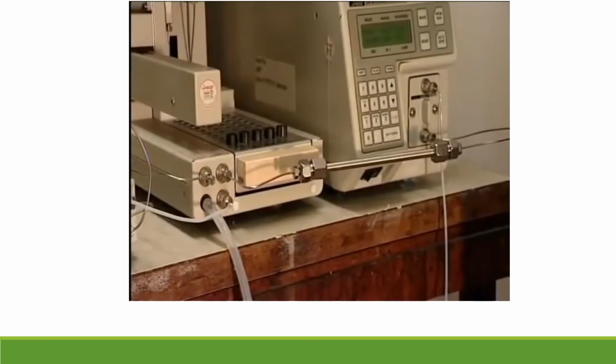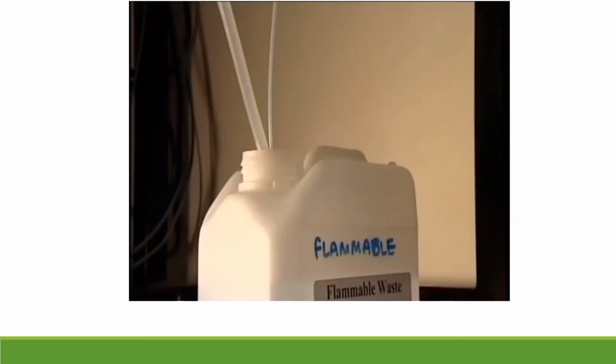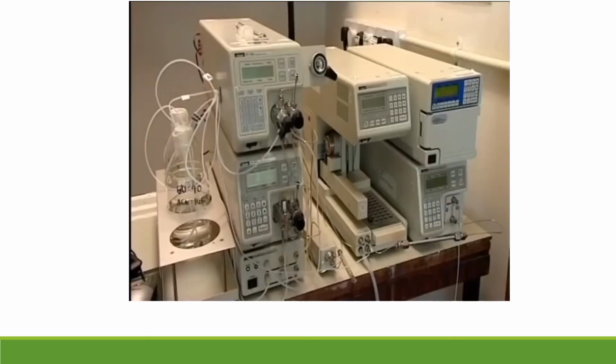In paper chromatography, the solvent moves along the paper by capillary action. In HPLC, the liquid is forced through the column by high-pressure pumps. The whole apparatus looks like this.